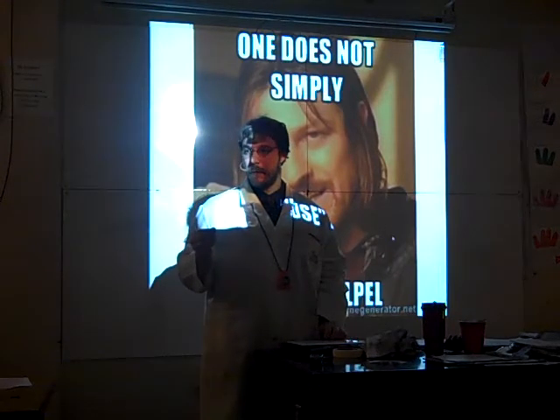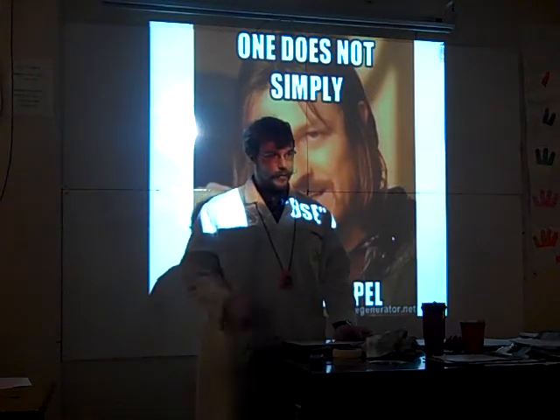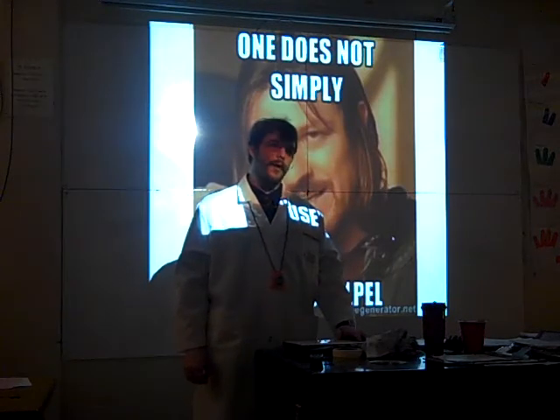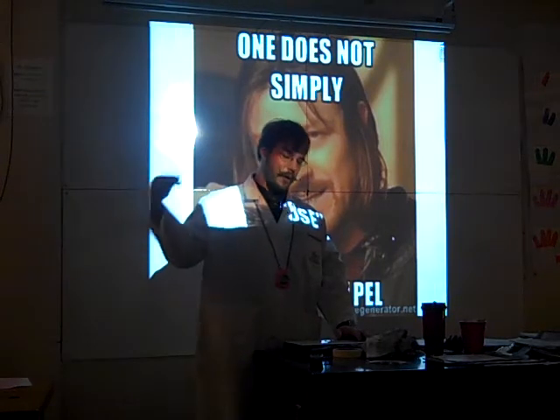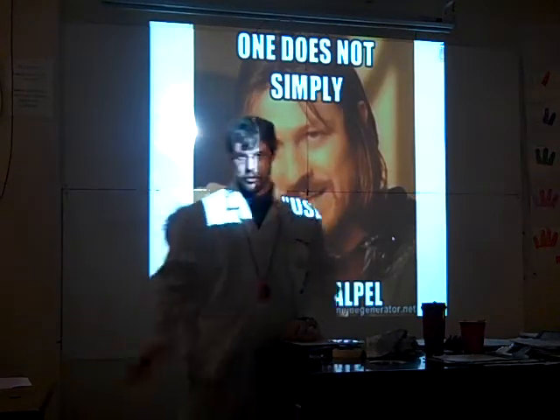That's what makes them sharp. If you accidentally break one, I need to know immediately. My second year teaching, a kid left a broken scalpel blade just sitting all broken in pieces, shards of dangerous metal sitting on the lab bench. I failed the whole class. If you break a scalpel, I need to know immediately. If you see a broken scalpel, I need to know immediately. See what I'm saying here?